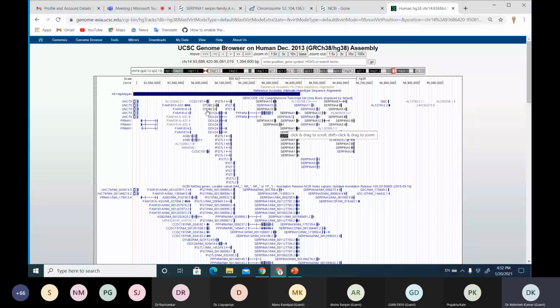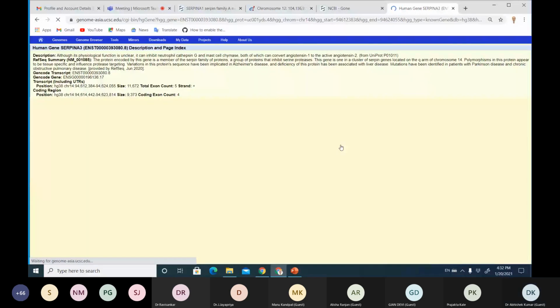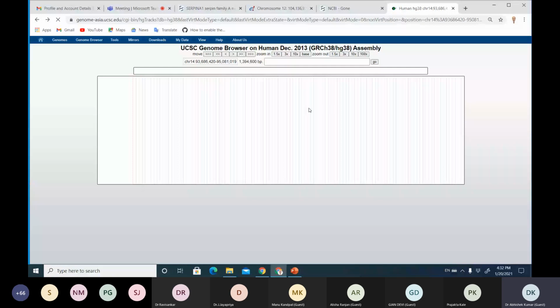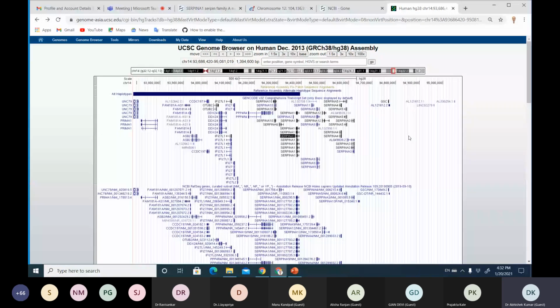And in this browser it looks different, and you can just take a screenshot of it and do the same for mouse and take a screenshot of it, and so we'll see what the differences between them are. I do not touch it actually. So in this browser, you can actually explore a lot of information from different sources. And what is provided here: mapping and sequencing, gene prediction.